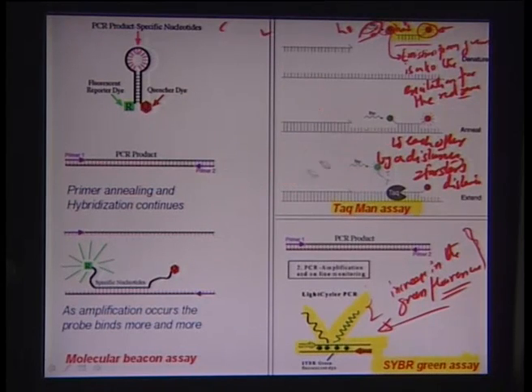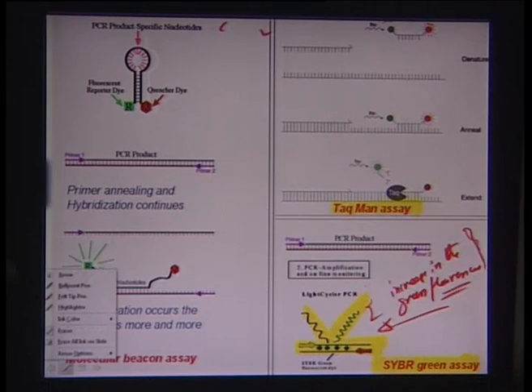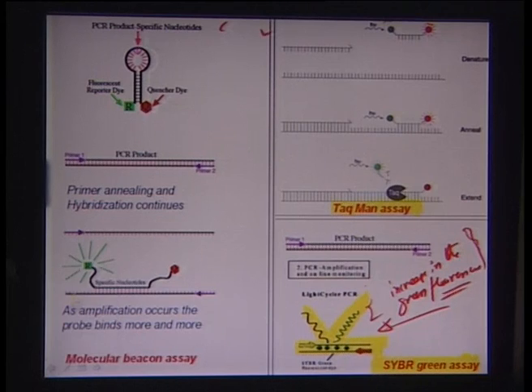So, essentially these different steps are indicated in this particular illustration here. You can see here that the primer comes and starts binding, separated by a distance equal to the Forster's distance of a green fluorophore and a red fluorophore. And during the denaturing step, the molecules separate.